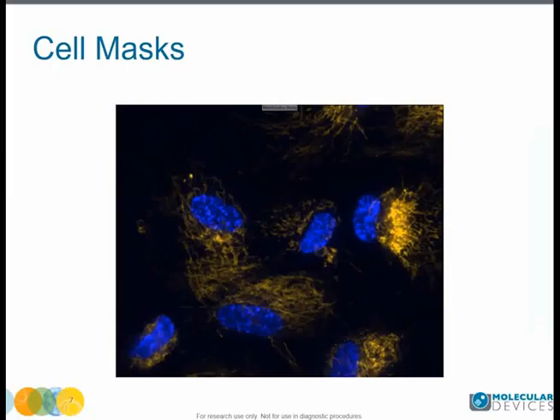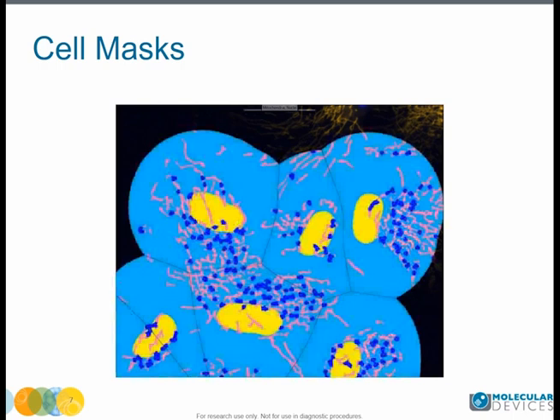We have the masks that we really need to make the measurements we want from the module now, but we need one more mask as the parent to enclose all the mitochondria and the nuclei for the cell. There are different strategies to do this, depending upon what you need to get out of the module. We have a good nuclei mask, so we could define a cell as those pixels in and around the nuclei, which would look like this.